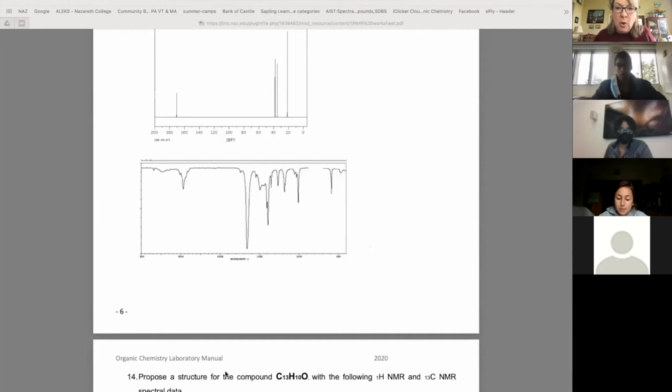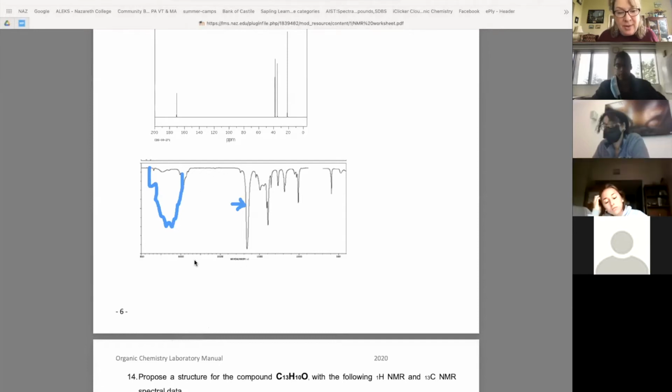I'll do this super quick, and then I'll get to your question number one, Kiara. This would be an alcohol. This would be a carboxylic acid. That's a carboxylic acid. This is a carbonyl, and those are the main ones. And then the jigsaw for the benzene. I don't know how we know that, but those are the main ones.